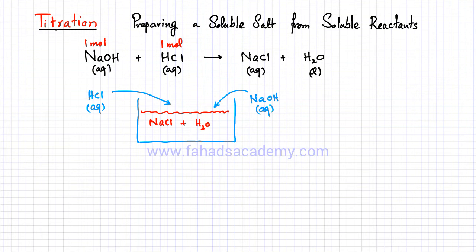Now, when I'm in the lab, I can't really count how many molecules there are. I can't even measure the volume because let's say I have a smaller beaker of NaOH over here. And it's full of NaOH, but the thing is it's a dilute solution. So if it's a dilute solution, there will be fewer particles. On the other hand, if I take a beaker of HCl, now I know that they react in exactly the same amount. If I have 1,000 molecules of NaOH, it's going to react with 1,000 molecules of HCl.